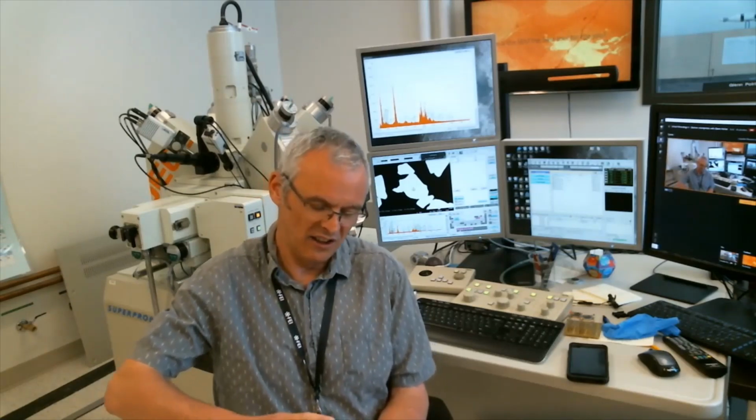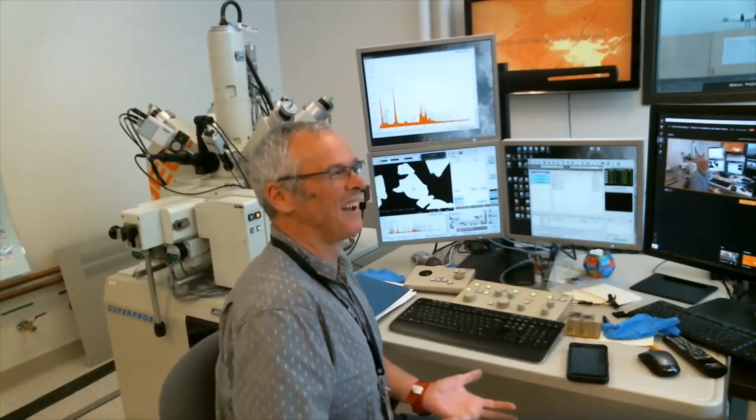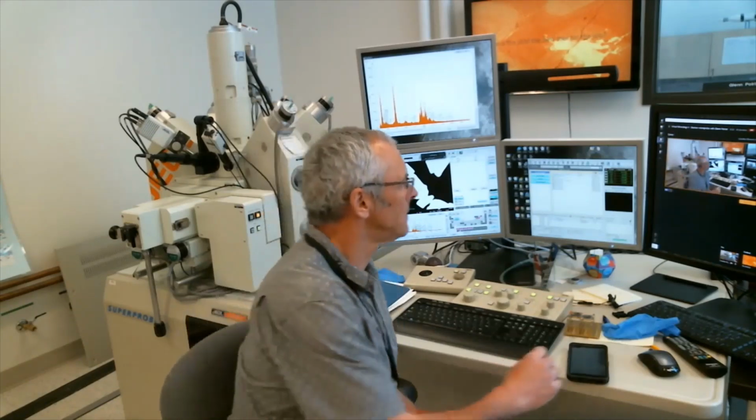So if we get an electron in iron, say, that falls from the L shell to the K shell, it's going to emit an X-ray photon that's got an energy of 6.4 keV. I know this because I just realized today I've been working at this job for 30 years, actually, this week. But so 6.4 kilo electron volts. And so if we see an X-ray photon that's got that energy, we know it came from iron.